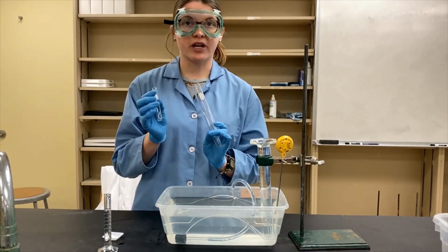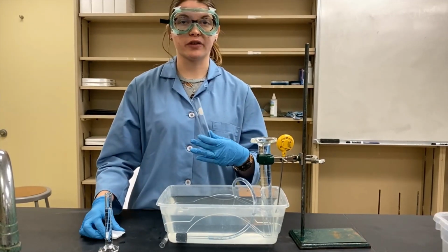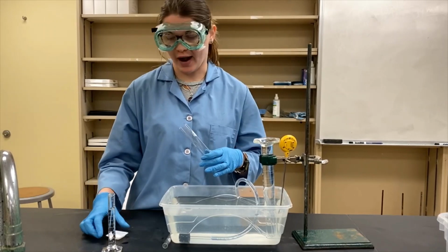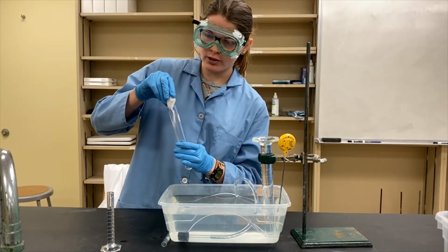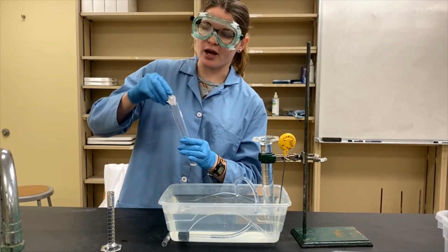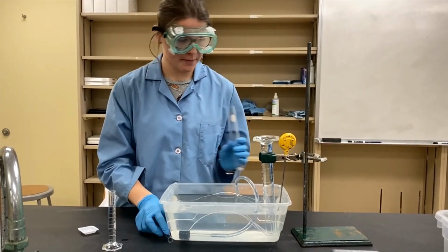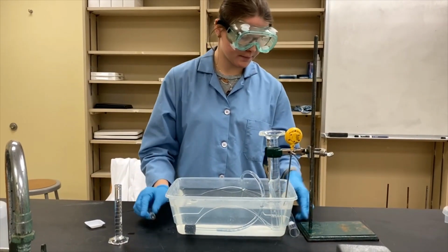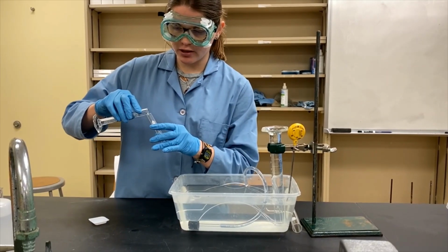We're going to use 2 test tubes here, different sizes. That way we can control when the two substances interact. So I'm going to put the calcium carbonate in our larger test tube. The instructions say to do it differently than how I'm going to do it, but we find it's a little bit easier to do it this way. And then I'm going to get my hydrochloric acid in our small test tube here.